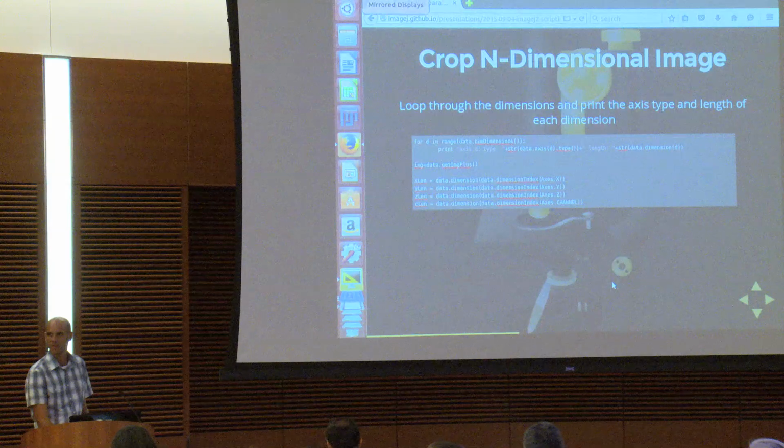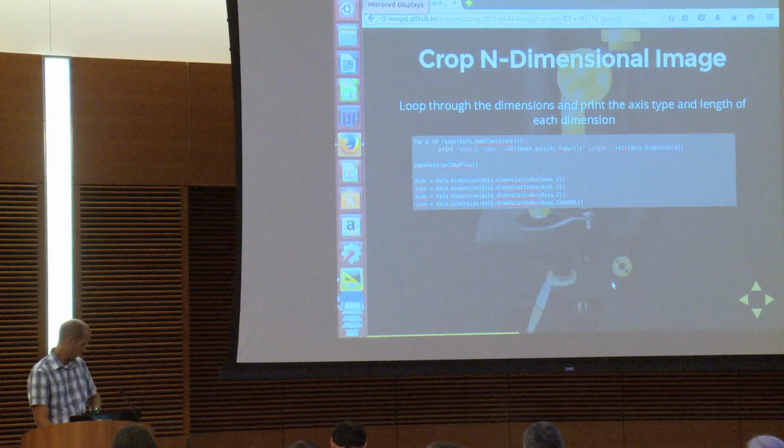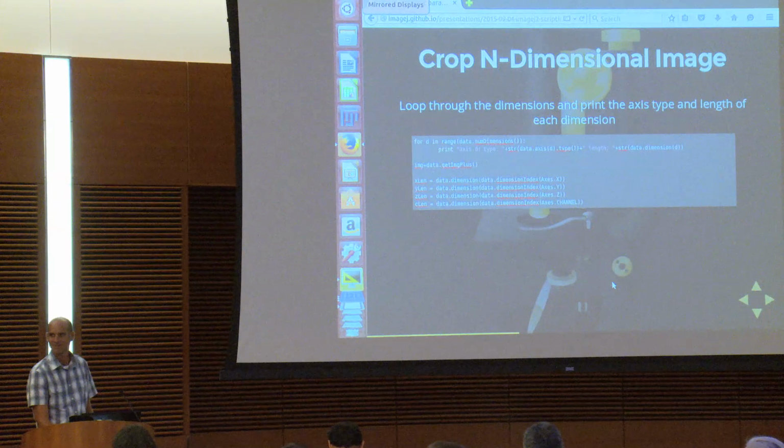Since we only asked for one, it would be the active image that fills in there. Canonical series is what we opened, so that's what's going to fill in there. The fact that we have data and IMG is unfortunate, and that problem will go away, because you won't have to unwrap it. There's no such thing as two active images.